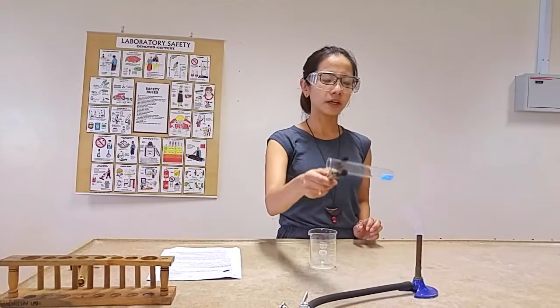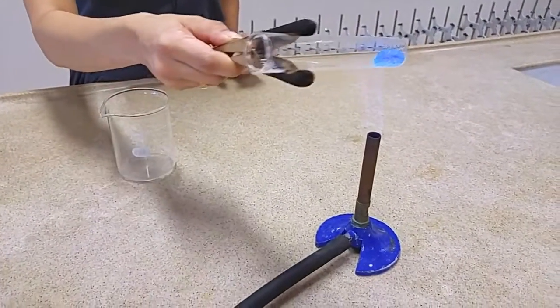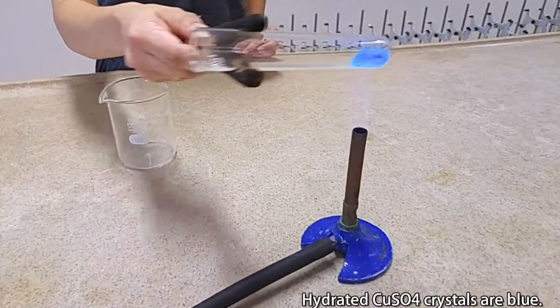Loosen it slightly, then gently put it over the flame. You'll see that water is coming out.